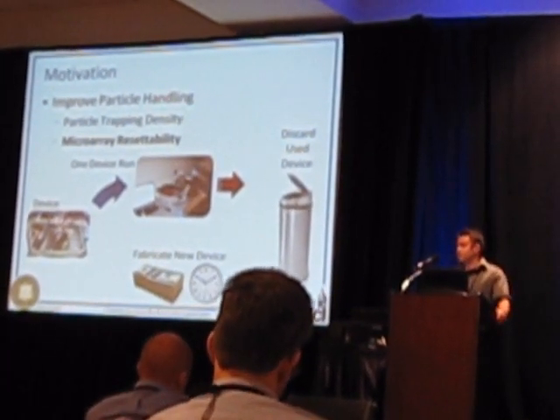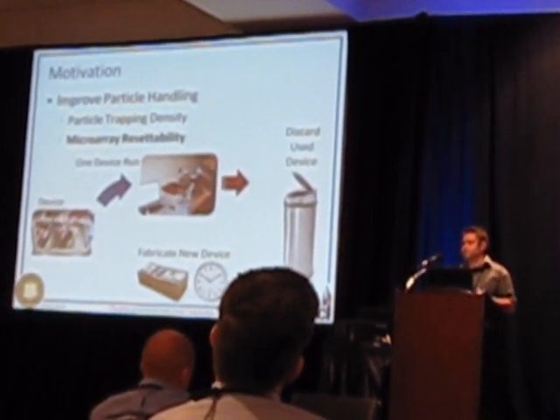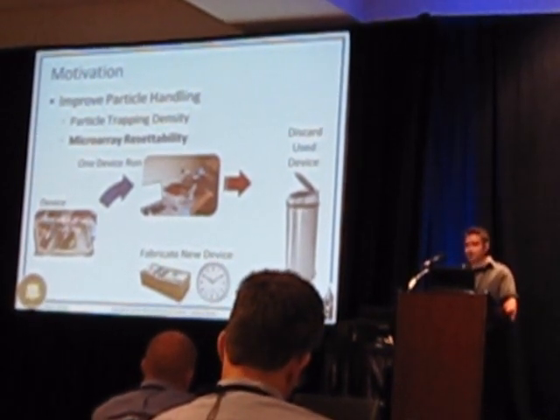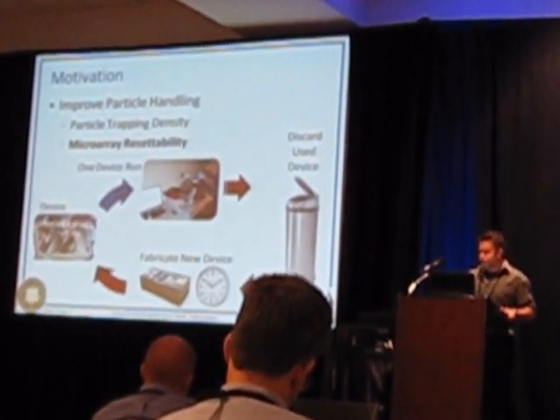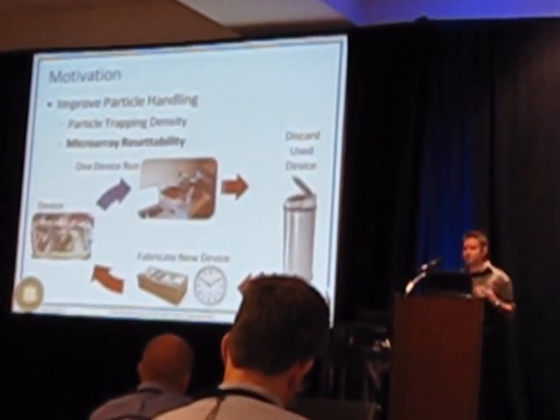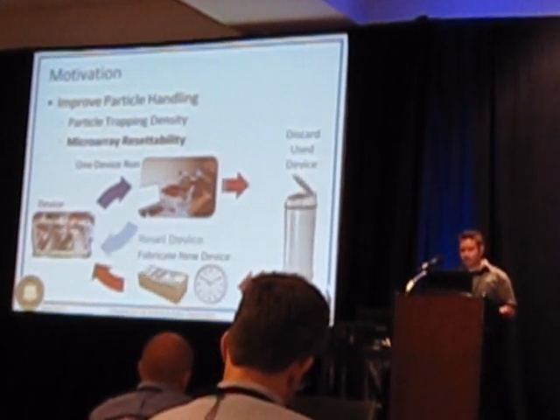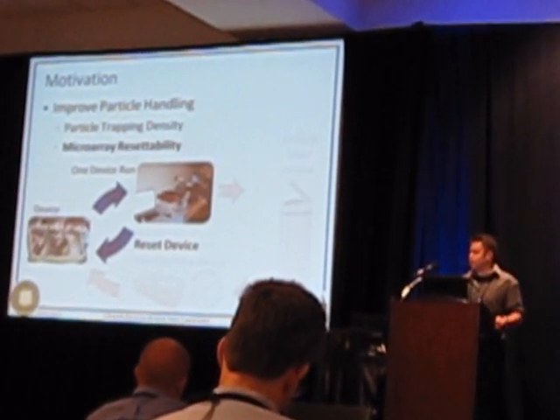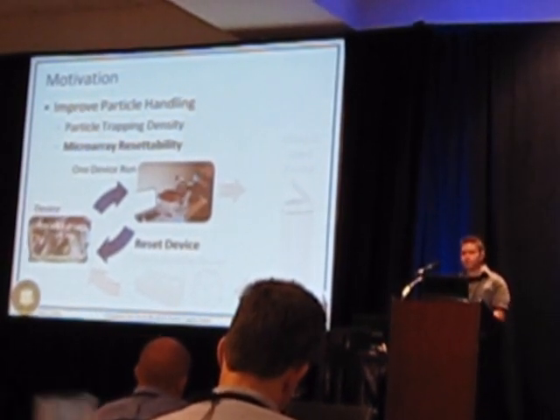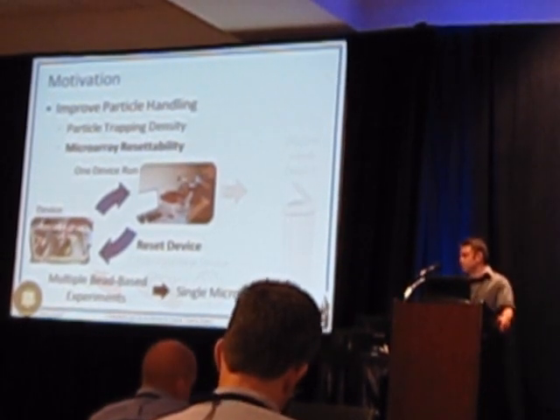And for us specifically, this ended up coming down to roughly 70% of our time being devoted to fabricating devices, and 95% of our money. And so then you finally get back to square one and you have your new devices. But the reason for microarray resettability is really to streamline this process. And instead, simply reset the device by releasing all the microbeads from the array. And by doing so, you can run multiple bead-based experiments using a single microfluidic device.